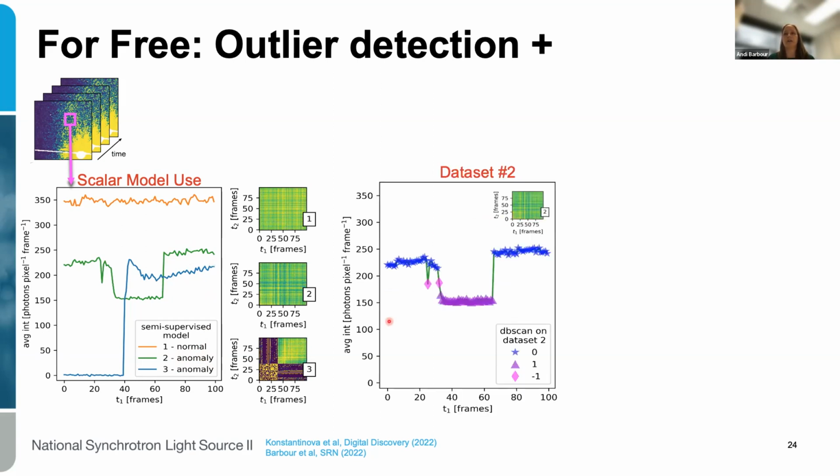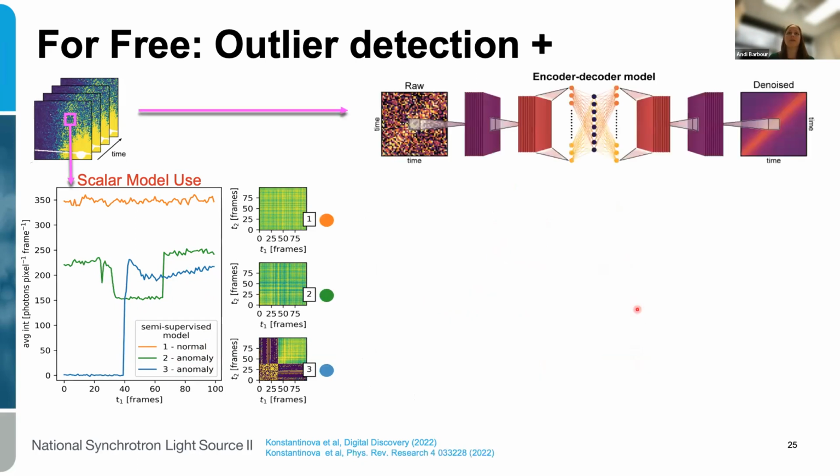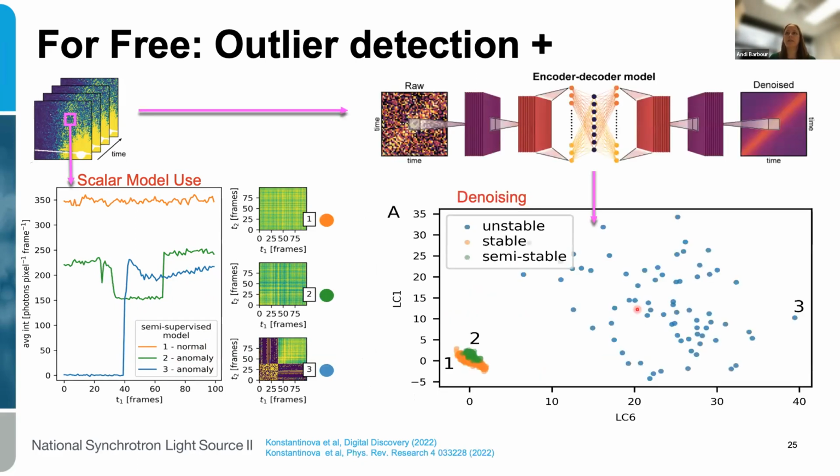And you can use out-of-the-box scikit-learn unsupervised methods to group these so that you can analyze them appropriately, much like a human would. And then you can see for data set 2, these are the 3 results, which on their own, neither one of them are very useful. Instead, we can use the latent space from the encoder model. So you don't even need to let the entire pipeline run. You can just extract the information after you've encoded and compressed it.